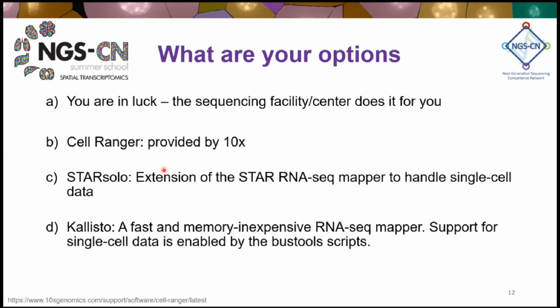The drawback here is that you need a really good annotation and you don't get all the features of, let's say, Cell Ranger.